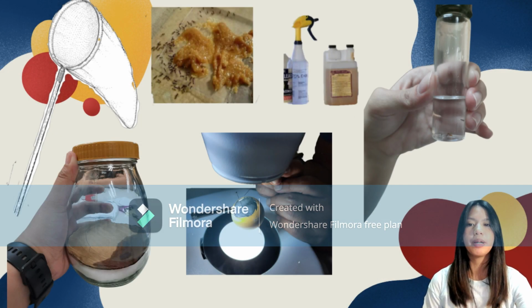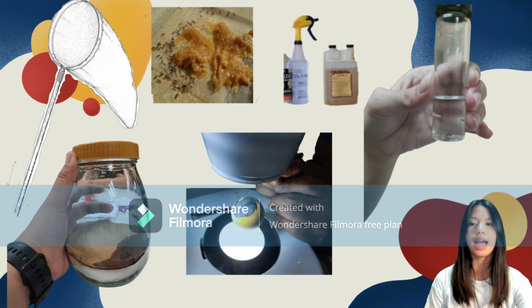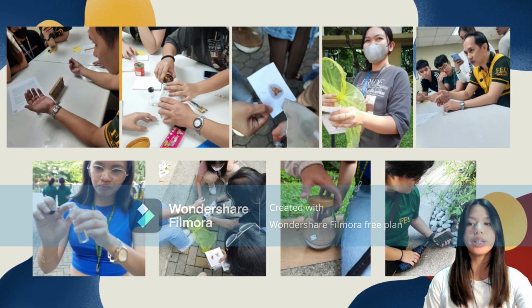Now, let's talk about the tools you need for collecting insects. Basic tools include nets, containers like jars or vials, and perhaps a magnifying glass to examine specimens closely. One way to collect insects is through active methods. You can use a net to catch flying insects or gently shake vegetation to dislodge them into your container. For some insects, like those hiding under rocks or in leaf litter, you can carefully lift or turn over these hiding spots. Another approach is passive collecting.